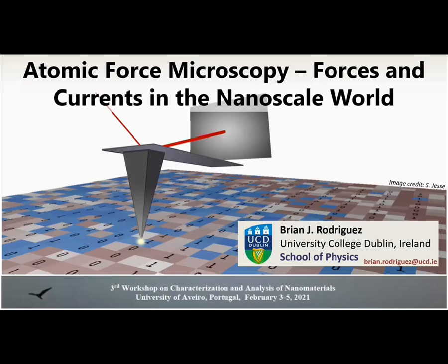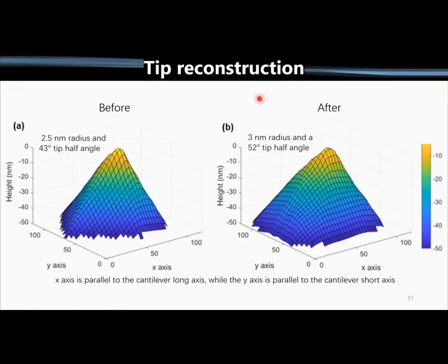So the conducting diamond probes that we use, you can use for PFM as well as for conducting measurements. And even after doing all of the machining that I showed, the tip radius didn't change very much. So the single crystal diamond probes are very wear resistant. And if your issue is related somehow to tip damage owing to the hard properties of the crystal you're studying, then maybe a more suitable tip would help. But I'm not sure.